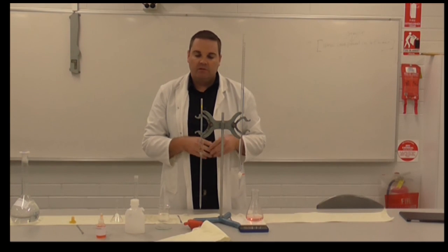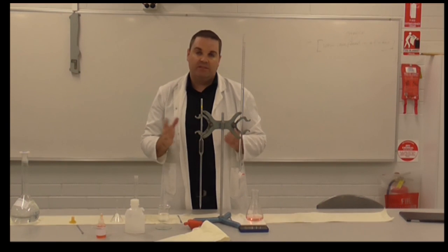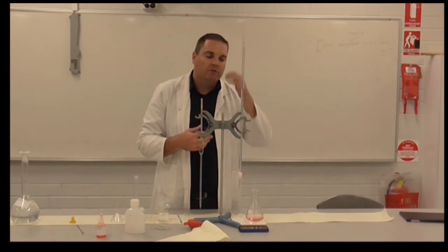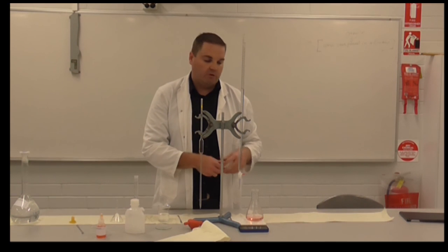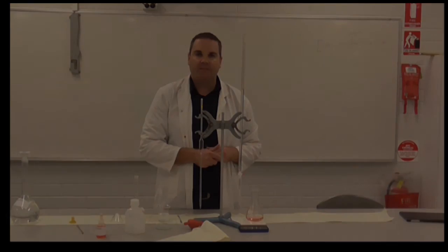Once you're all done, simply rinse everything out with distilled water, turn it upside down to drain out, and you're done. Hope this has helped you in terms of knowing the correct techniques. Go back and have a look at it because I know I've gone through it pretty quickly. Make sure you know how to clean all your glassware properly, make sure you know how to actually perform your titration — looking for your colour change, doing your swirling, controlling your tap — and you'll be fine. Thanks guys, see ya.